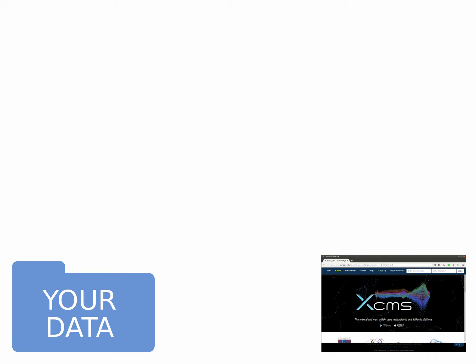Hello, we are proud to present our newest tool, designed to speed up the untargeted metabolomics workflow and obtain results from our XCMS Online platform.